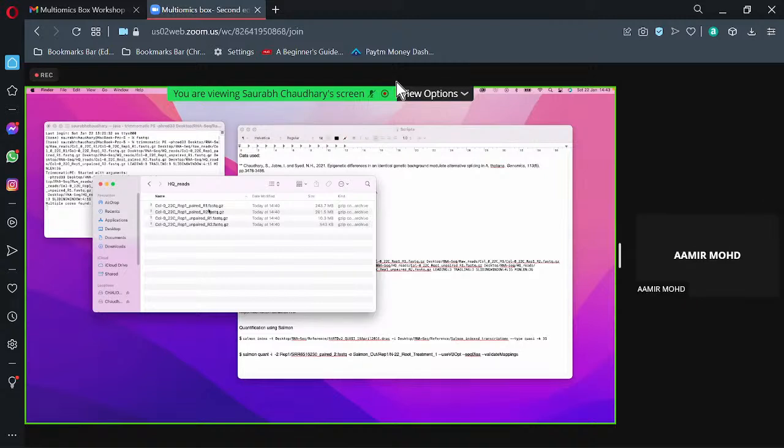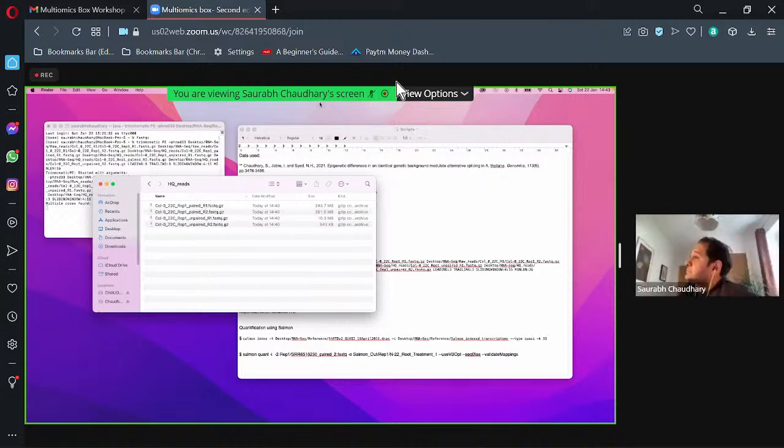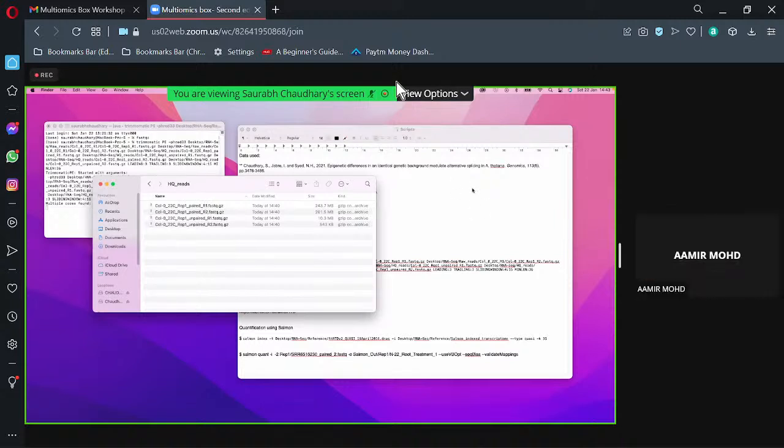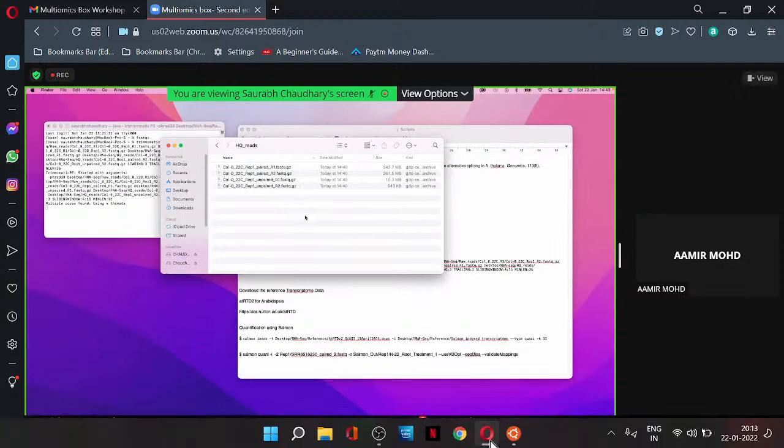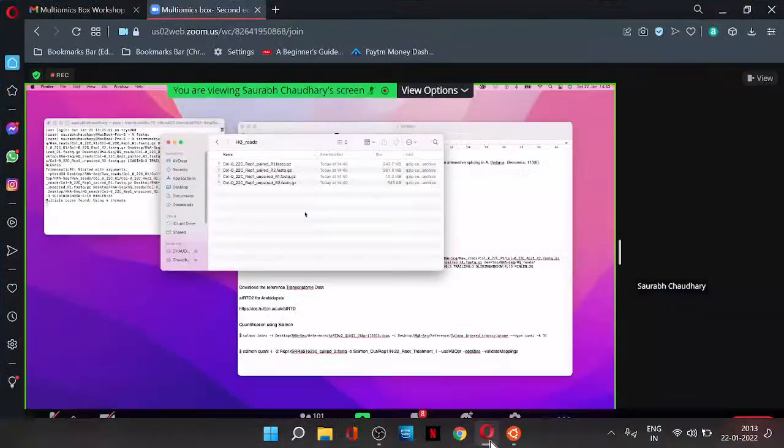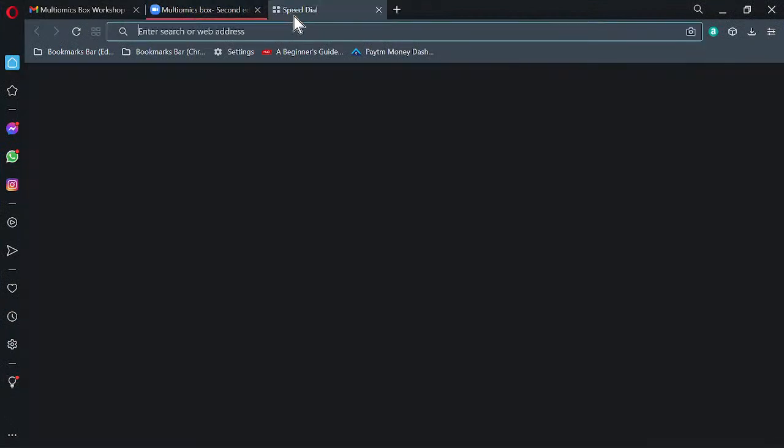Thank you. So one thing I would like to ask here is that as you have selected, there are multiple replicates, including the control and the stressed tissues. You have demonstrated here that you have selected the depth one only, or you can say the normal Arabidopsis in normal temperature, and you started the analysis part. So how can we compare the stress data with the control sample? Do we need to go for the analysis of each and every replicate?